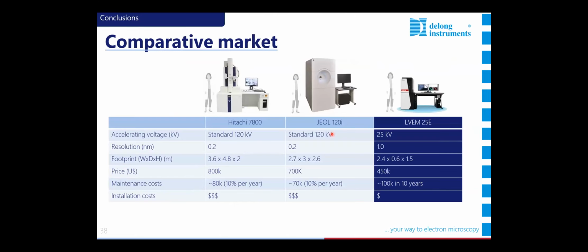I have a question. May I ask? I've seen in your picture that the thickness of the ultra thin section is about 90 nanometers.